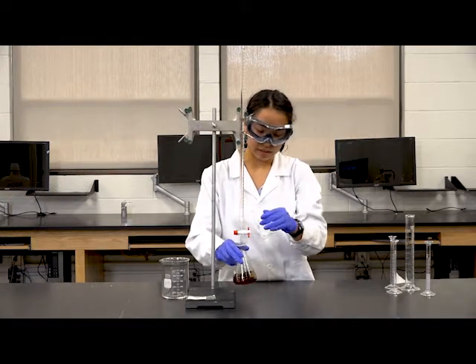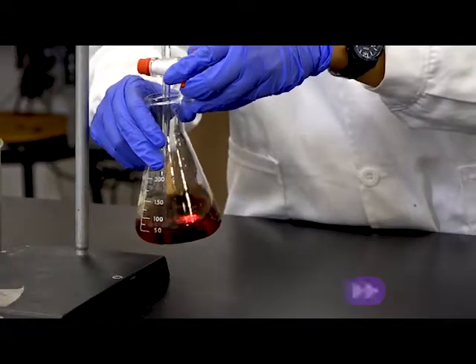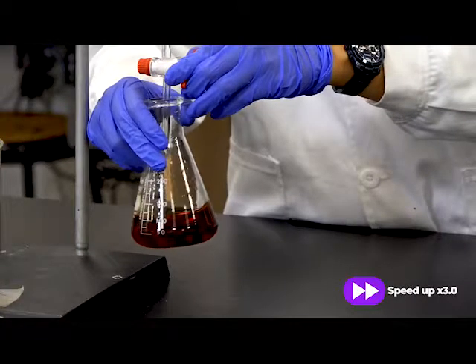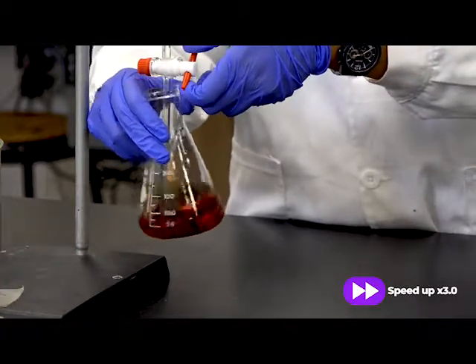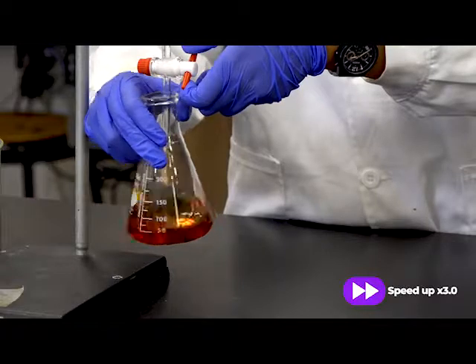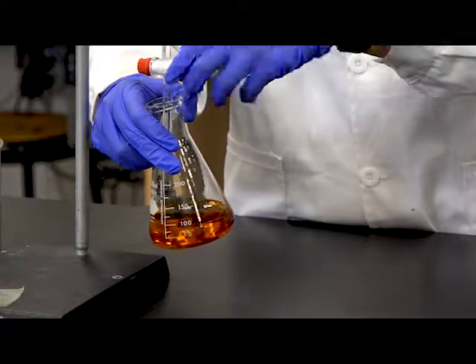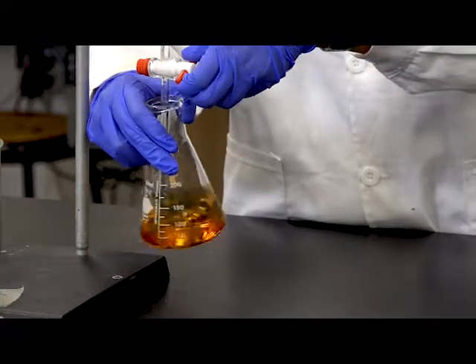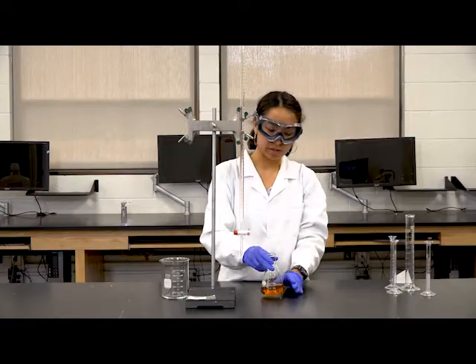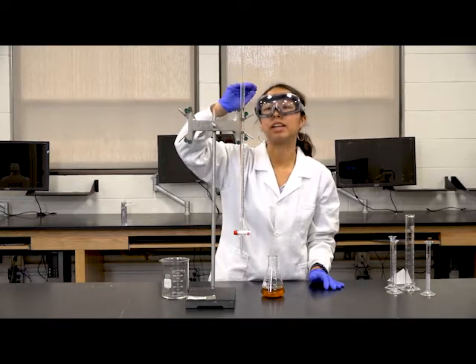With one hand you're mixing it, with the other one you're making sure that the burette flow is not too fast. Keep an eye on your solution because the color change should happen at any moment. Once you have reached a yellow color, you're ready to continue the titration and record the amount of sodium thiosulfate that you used for the titration.